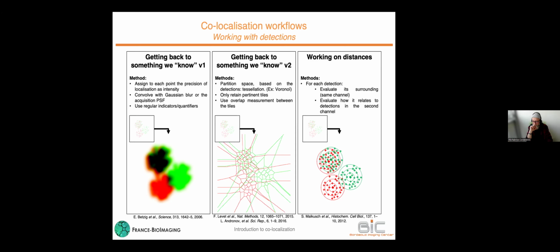I think it's different if we have small objects like RNA, like spatial transcriptomics, and if we have something that comes from SMLM, that is very different. SMLM is one type of super resolution that Hans spoke about this morning, and there the image is very different. So it's a very special case that you're talking about, where we have SMLM data, right?